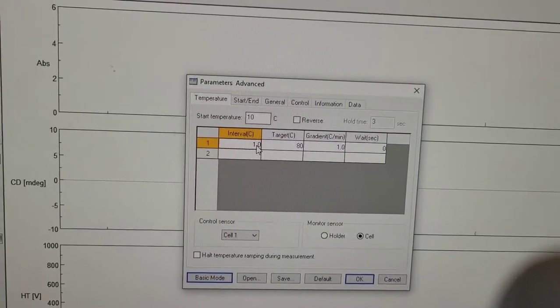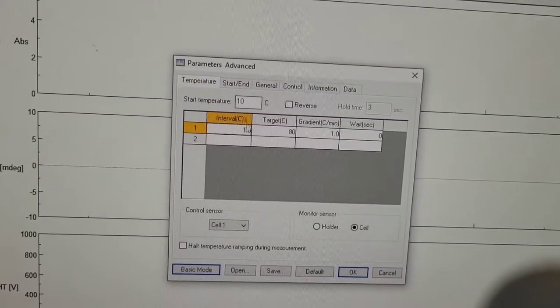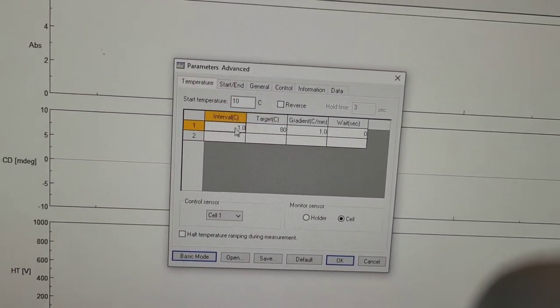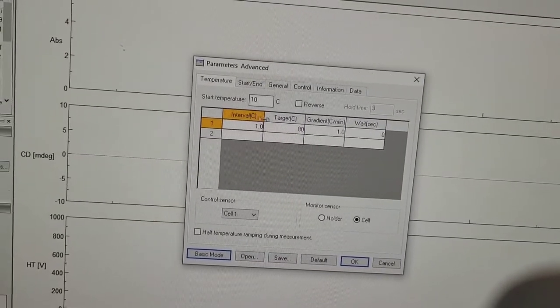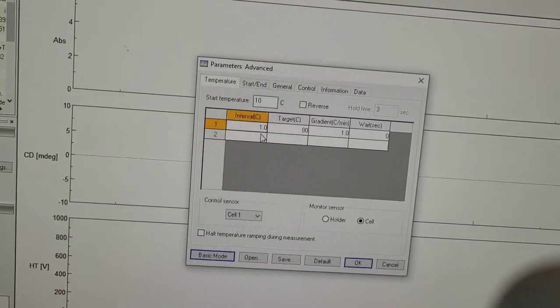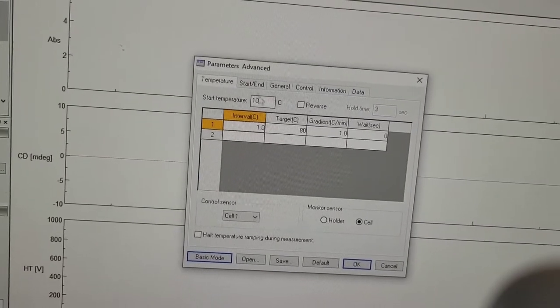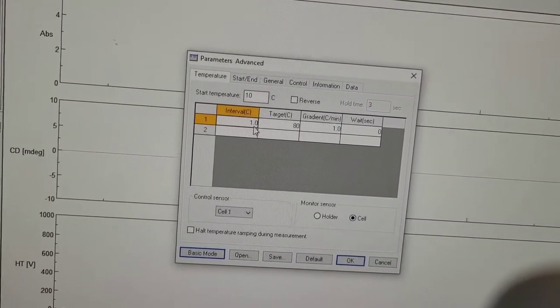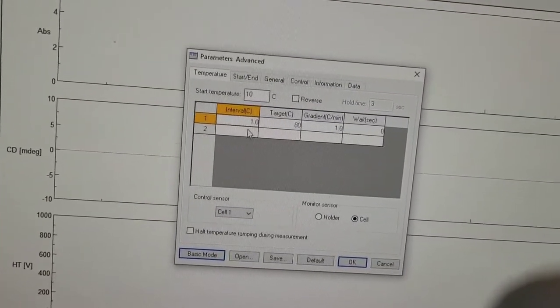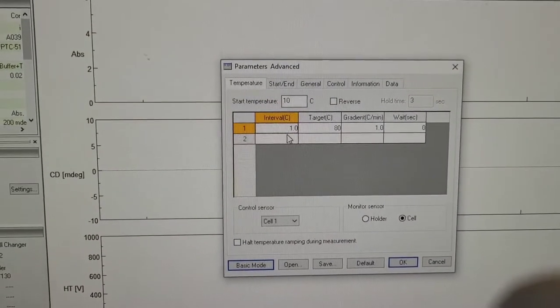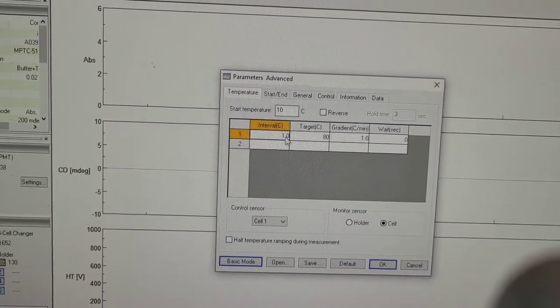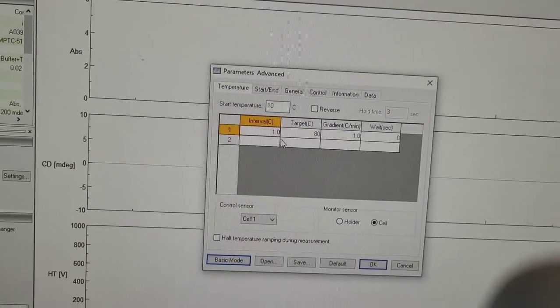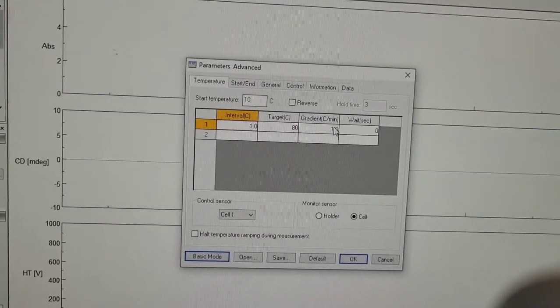And the interval that I want to do my measurements at is every degree, but you can also do maybe every five degrees. The more you care about it, the more intervals will help you determine the transition melting temperature better.